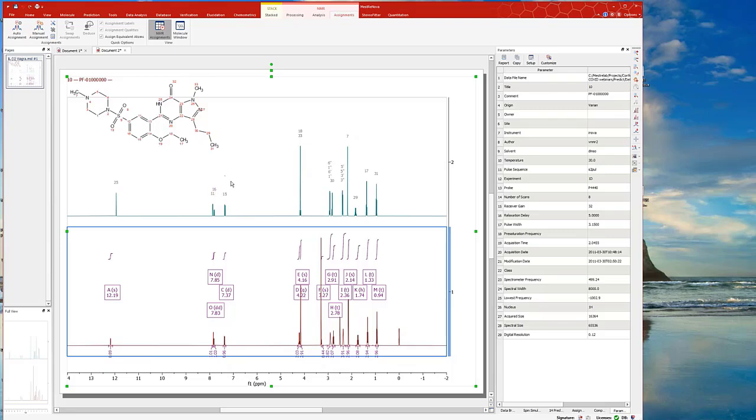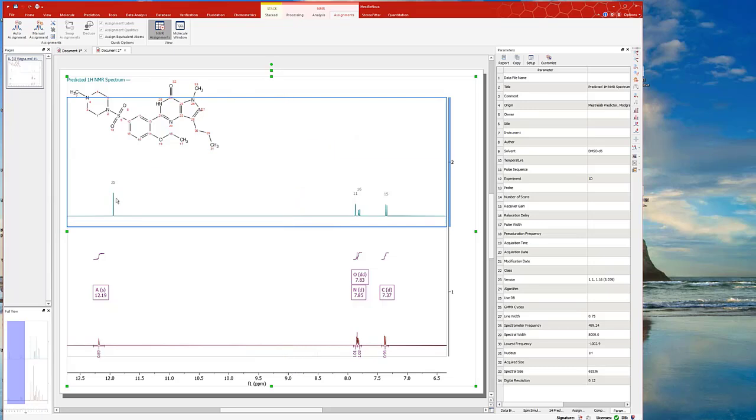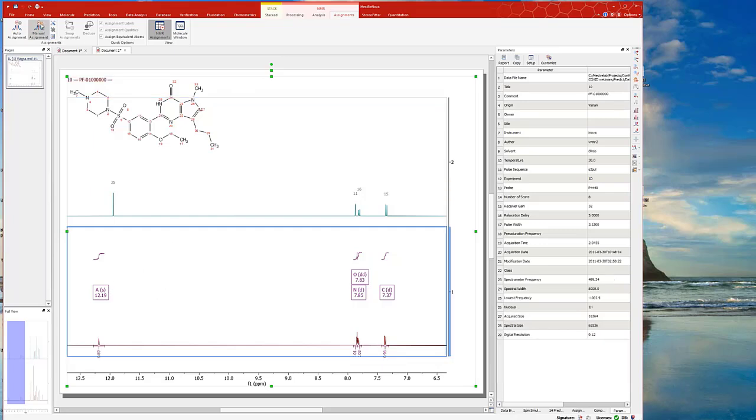So in this case, I'm going to follow each peak and see what I can do for the assignment. Right. So here's 25, this is close to it, and the line shape looks similar. So I will just highlight the experimental, click here, or the shortcut key, that's A. Okay, I click this multiplet label, and again, let's look at the structure here. We can look at here, 25, right, it is here. So yeah, it's assigned, the color shows the confidence judged by Mnova, right?